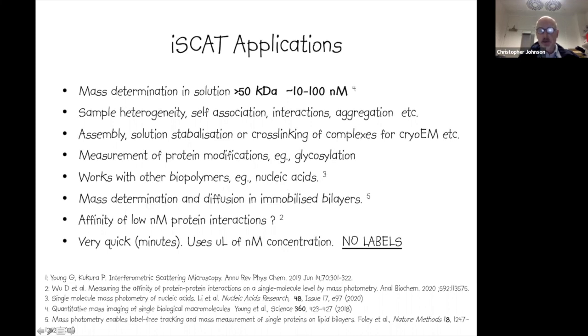And very interestingly, recently, last year, there was a proposal to use this technique to determine mass in immobilized bilayers. And this is a very interesting application that we hope to advance here in the LMB. In this case, on your cover slip, you would have an immobilized bilayer, and therefore the contrast that you see is the event where a protein lands and enters into this immobilized bilayer. But then having entered the bilayer, the molecule will likely remain within the bilayer, but it will be able to diffuse within the bilayer. So as well as determining the mass, because we're able to observe the contrast of the molecule within the bilayer, we can look at its diffusional properties using a process of particle tracking.